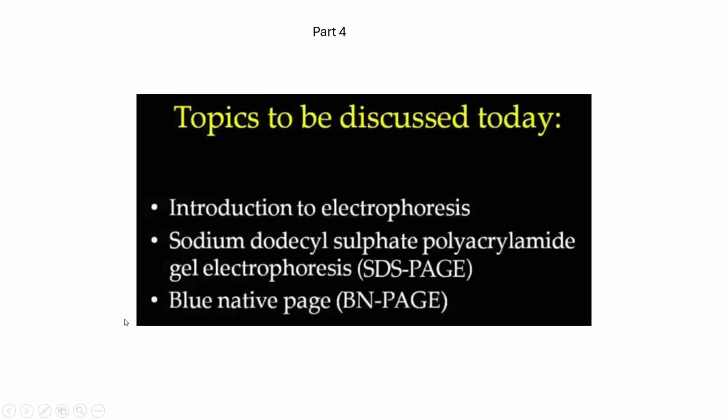So I just gave one example, the Trizol method, but besides that there are different types of fractionation methods and different types of precipitation methods. Depending upon the need, you accordingly select those and prepare your samples. So now your sample is prepared.